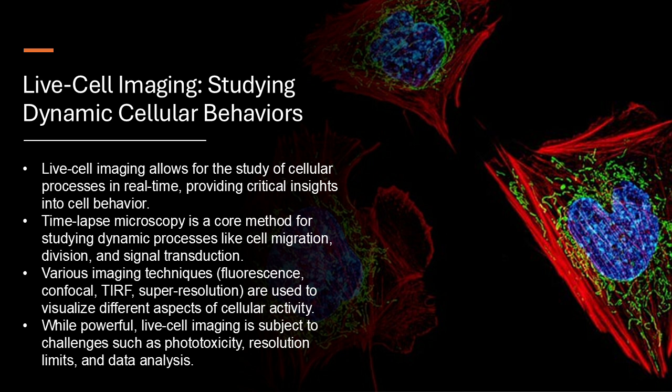It is, but live cell imaging allows us to see the individual neurons, how they behave, and how they connect to form those networks. It's like seeing the individual wires and circuits that make up a complex computer. So it's still pretty amazing. It is. Imagine being able to see how those connections change as we learn new things or form new memories. It's truly remarkable, and as imaging technology continues to improve, who knows what other wonders of the brain we'll be able to witness. Perhaps one day we'll be able to see those complex thought patterns you mentioned, or even understand how consciousness arises from this intricate dance of neurons. That would be incredible, but for now, even just being able to observe these individual neurons and their connections is a huge leap forward. It is. It's giving us a whole new level of insight into the brain and how it works.